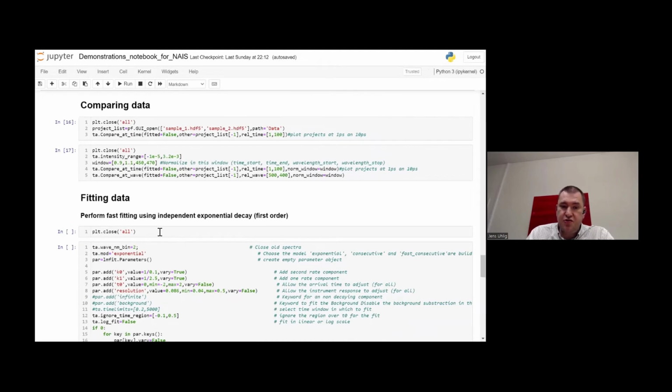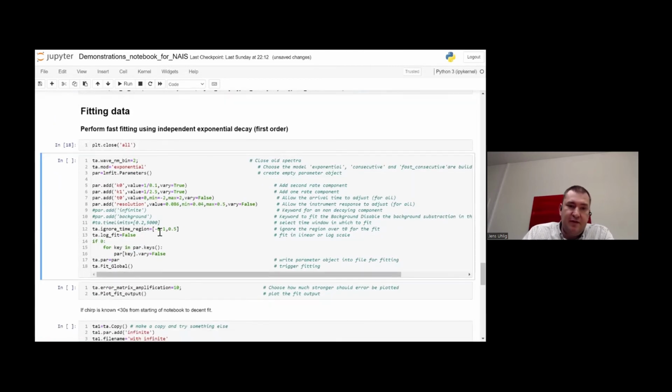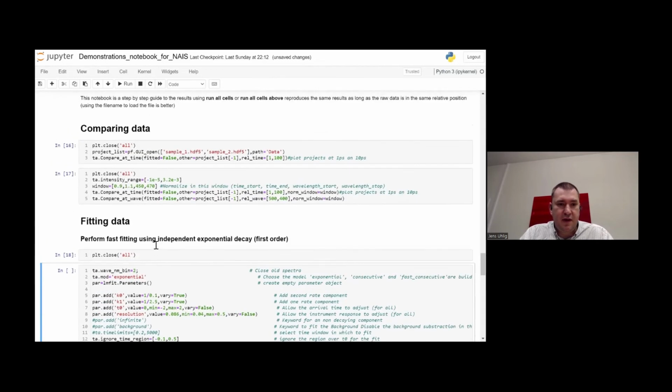The same approach is true for fitting, and that's actually the one I use most. I have again a notebook or a cell where I set the fitting parameters, and I, for example, use the output where I look at the SVD and say, okay, I have maybe 2 time points. Maybe I should bring that back up.